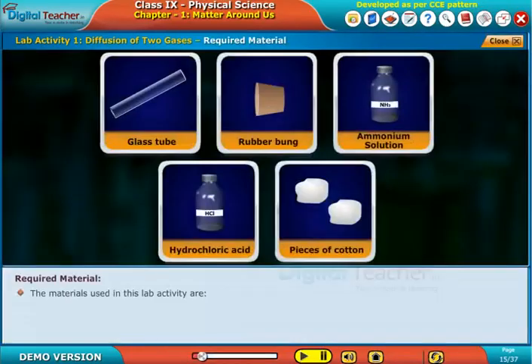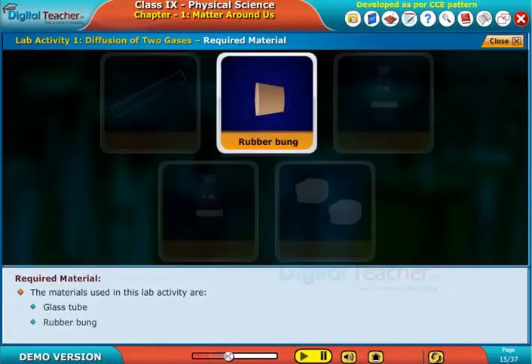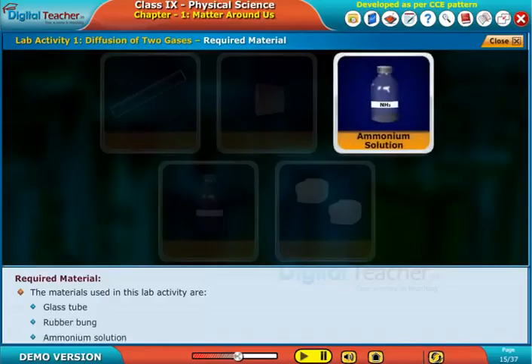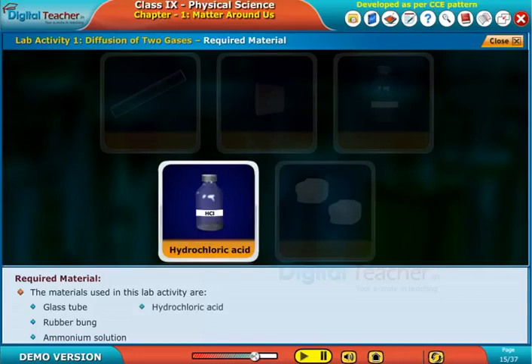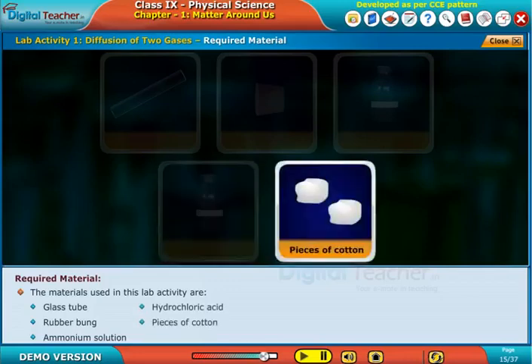The materials used in this lab activity are glass tube, rubber bung, ammonia solution, hydrochloric acid, and pieces of cotton.